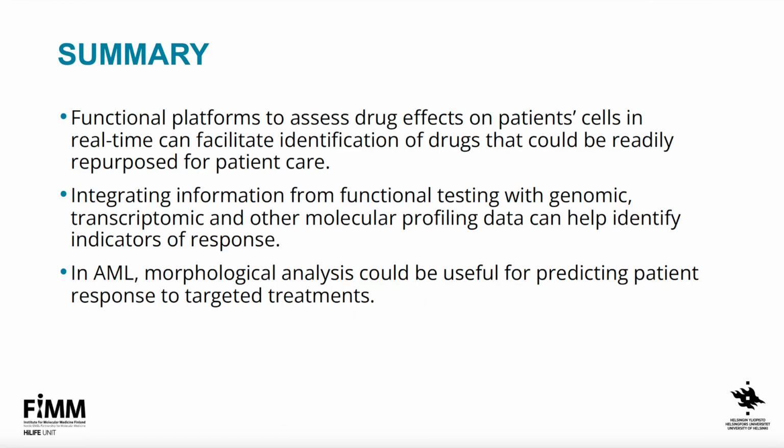And this really makes sense because with the different cell differentiation states in AML, the cells do look different, and so they will have a different morphology. And this is definitely being picked up by the DeepCell technology with REM-I and the Human Foundation model. So it was really nice to see this validation and the instrument being able to pick this up.